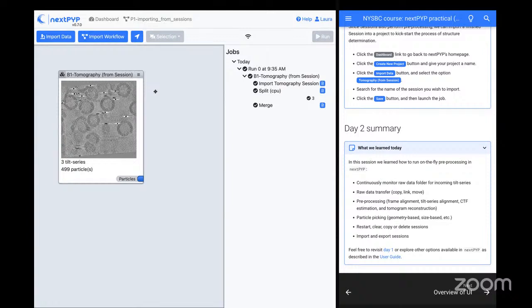You may not need it, but it's easy to just try both. Did you usually try them on non-denoised tomograms? Yeah, just straight weighted back projection, probably heavily binned. I can't imagine that ISONET is going to make it worse, but we haven't tried it. Okay.